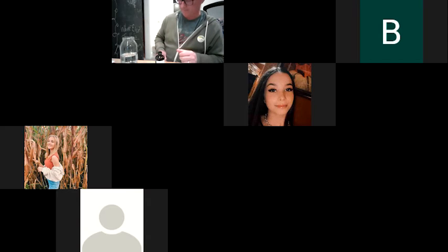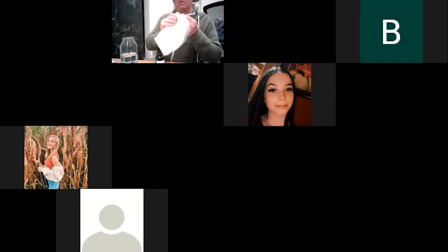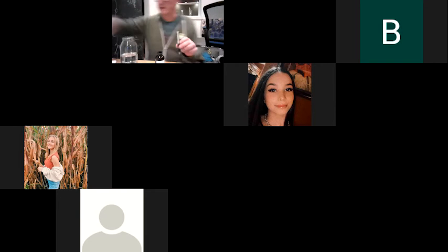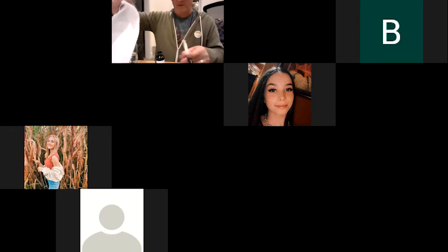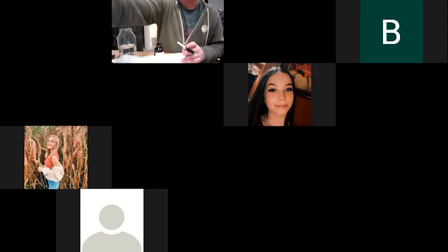So I want to get all the bubbles out, and get it to 5 mils. Okay. All right, so I've got it at 5. All right, so I get a white sheet of paper, so you can see this for yourself.